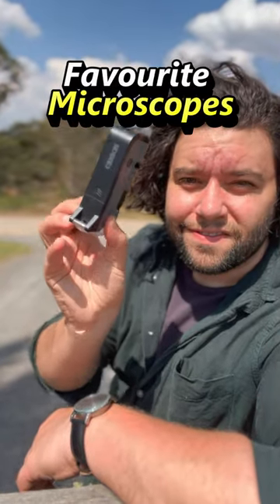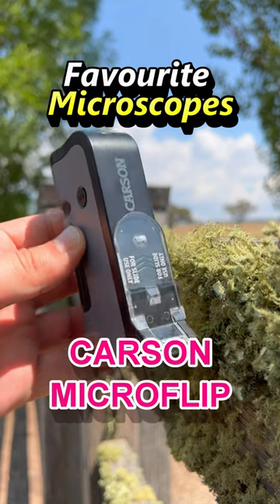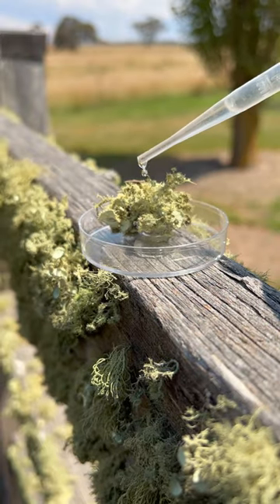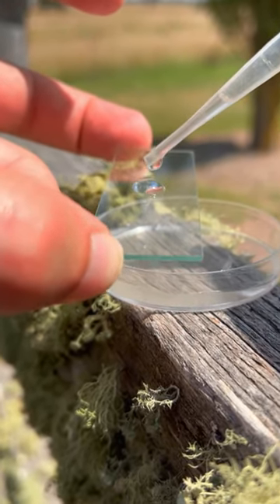This is one of my favorite microscopes, the Carson Microflip, and it's less than 20 US dollars. I love this microscope because it gives you the exact magnification you need to find a tardigrade. And that's what we're going to use it for today.